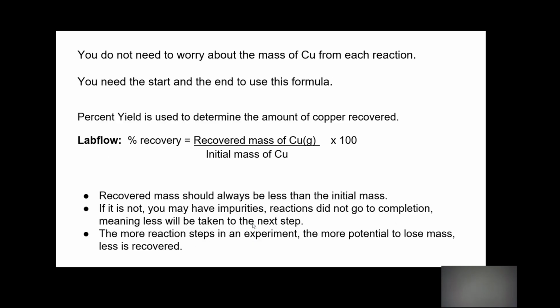Okay, so this lab is a little different in that it asks more about the series of steps than it does involve calculations. So it's really hard for me to actually show you how to do this lab.